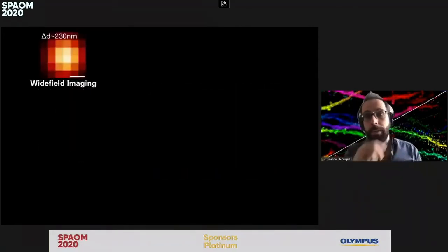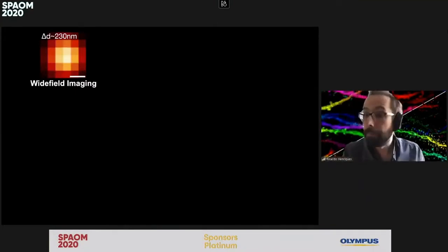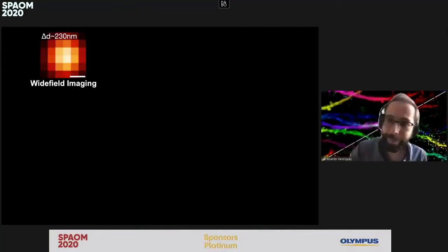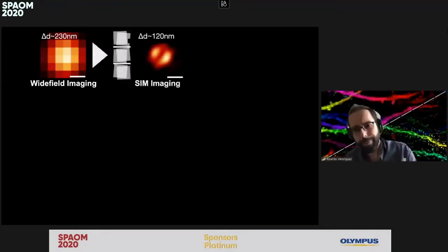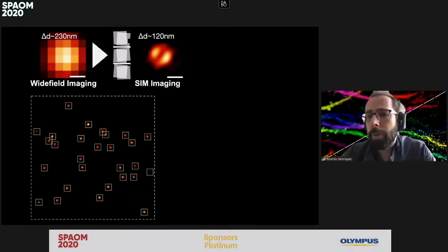I'm going to show you, for example, the deadliest virus we ever faced as humankind, pox. It killed millions of people. It's actually kind of responsible for the reason why Europeans colonized America, because pox decimated the native population when the Europeans went there. But it's also quite a big virus, which means that even with structured illumination microscopy, which just increases resolution by a factor of 2, you can already start getting structure. One of the beautiful things about viruses is that extracellular viruses tend to have a metastable structure. That means that if you have some of these viruses on the coverslip, you're going to see the same structure over and over again, just in different rotations. Because of this, one of the things that we created was a software called VirusMapper.